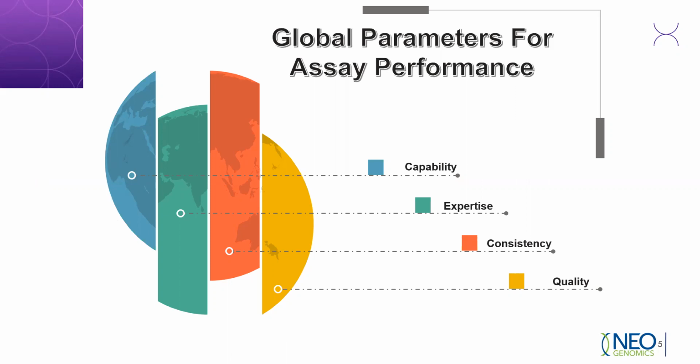Consistent assay performance is required for single phase and longitudinal trials. Due to the limited stability of peripheral whole blood and bone marrow specimens, it may be necessary to implement flow cytometry testing in multiple testing locations across the globe or across the country. When these instances arise, we need to have confidence that the data generated will be reproducible and reliable across these different locations. Harmonized methods, both the process method itself and the analysis method, a standardized instrument platform, a robust instrumentation calibration process, and reagent control are all very key aspects.